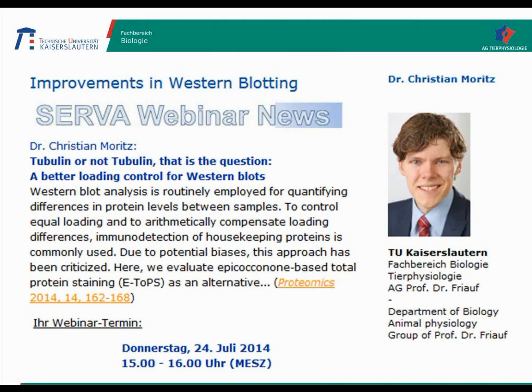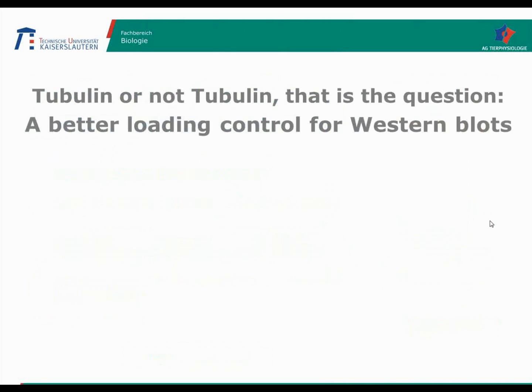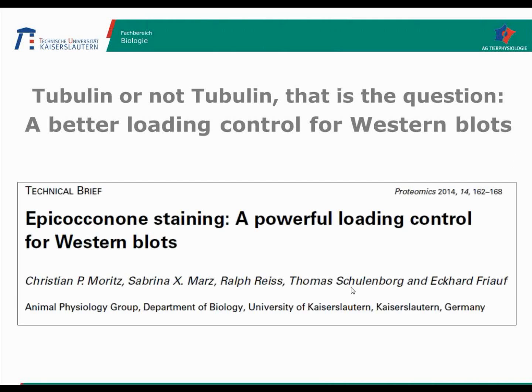For this webinar I have chosen the more entertaining title, "Tubulin or not Tubulin, that is the question: a better loading control for Western blots." This Shakespearean idea came from my colleague Thomas Schulenborg, who is also one of the co-authors of the publication in Proteomics, which came out at the beginning of this year. We have chosen the more factual, objective title: "Epicocconone staining, a powerful loading control for Western blots."